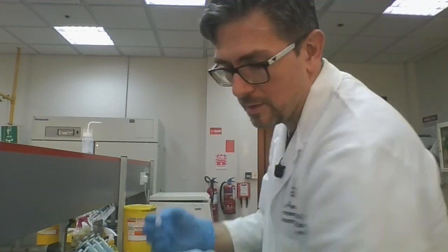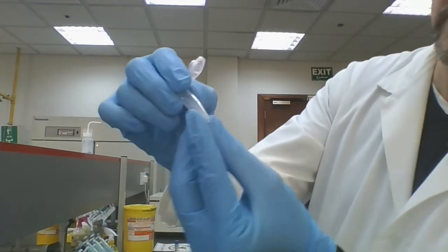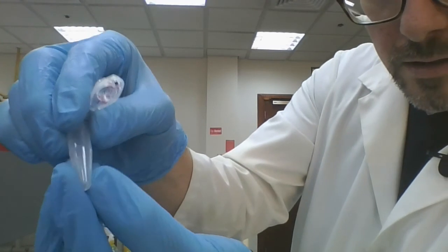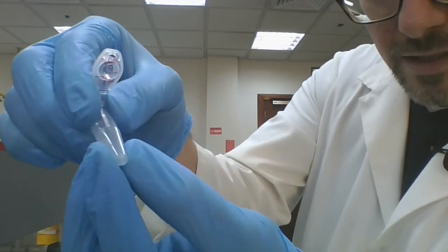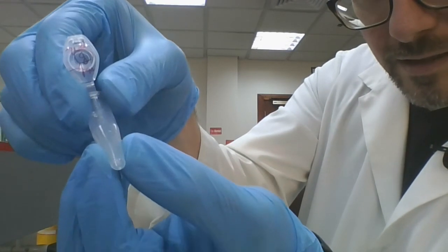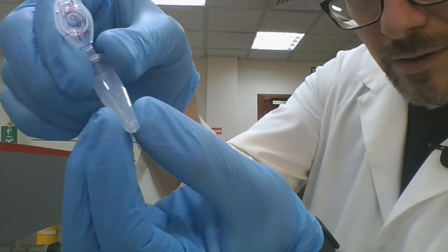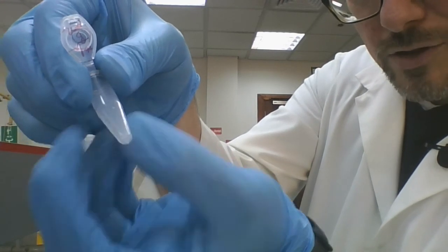So again, I'm going to use a paper towel and tap out the excess liquid so I can see the pellet a little bit more clearly. And again, it's right there. I don't know how well you guys can see this, but there is, in fact, a pellet. I really am not pretending or making this up. Oh, I think you might actually be able to see it now at this angle. Okay, so there's a pellet there.